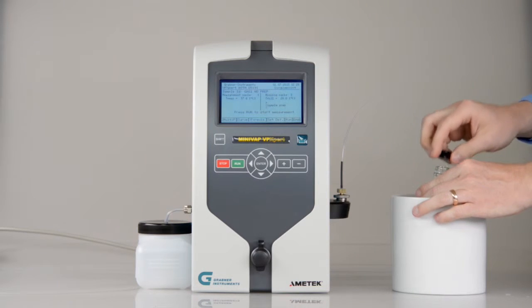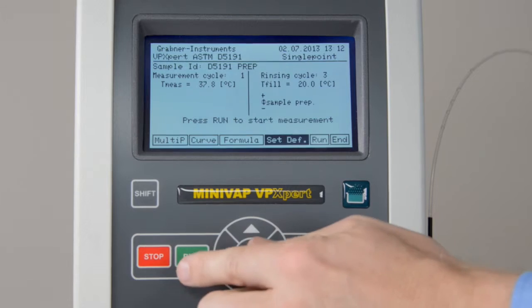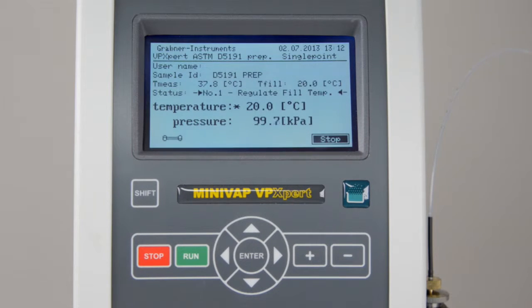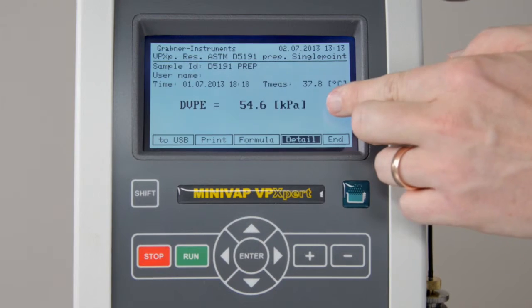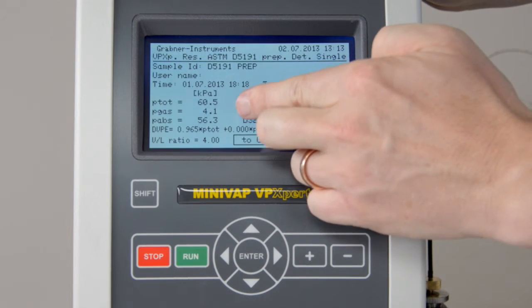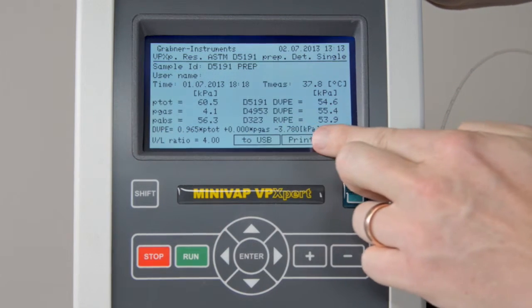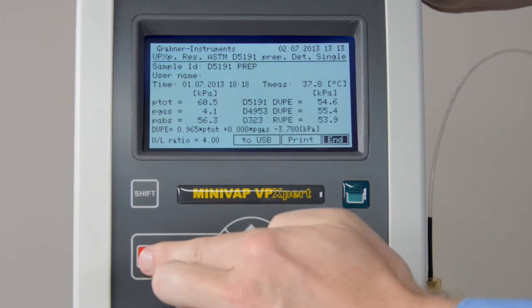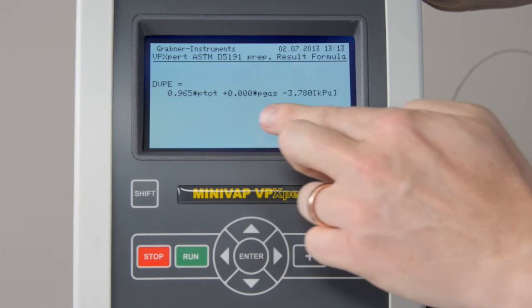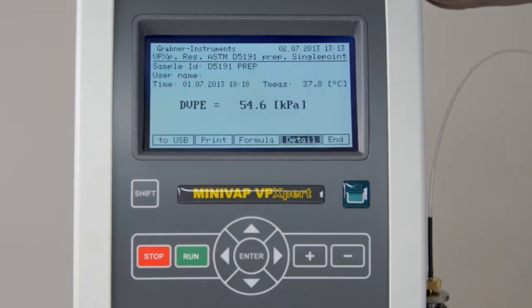Put the tube into the cooled and air-saturated sample. Run the program. Check the results. Note that the result now shows the DVPE, the dry vapor pressure equivalent, required by ASTM D5191. Click on Formula to check the ASTM D5191 DVPE correction formula for measurements with sample preparation.